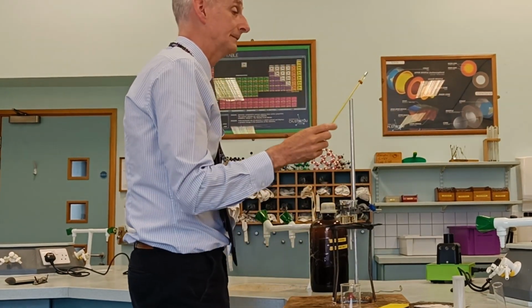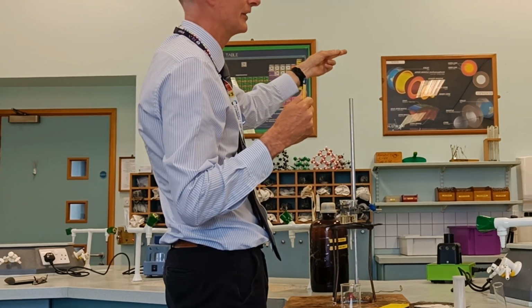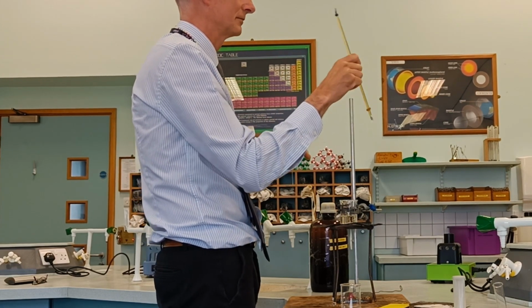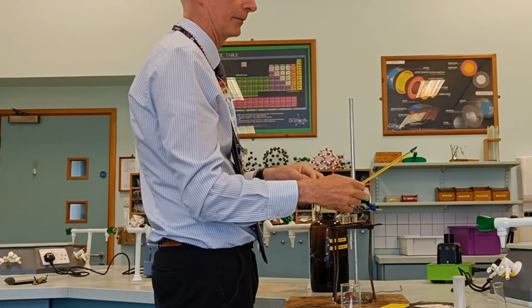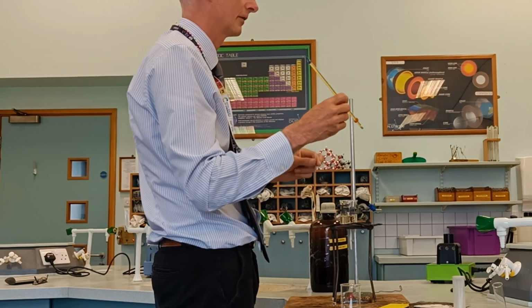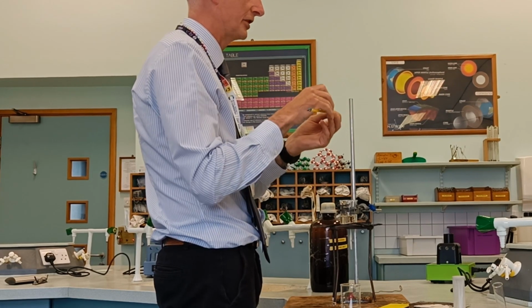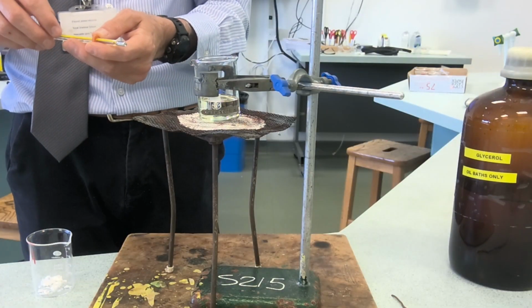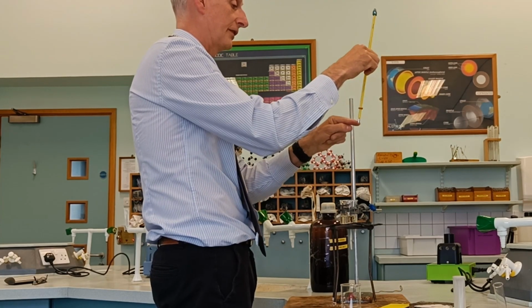So I've got myself a thermometer, and the standard ones we use are no good because they only go to 105, 110. So this is a mercury in glass thermometer. You can tell it's mercury, whereas those are alcohol ones. This one goes up to, looks like, 240 degrees, so it's well within the range. There's a little bit of rubber tubing there to hold the sample next to the thermometer bulb. I'll shuffle it around so I can see both the sample and the scale at the same time.